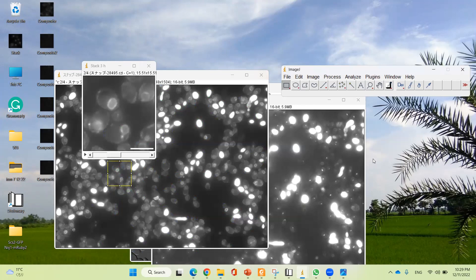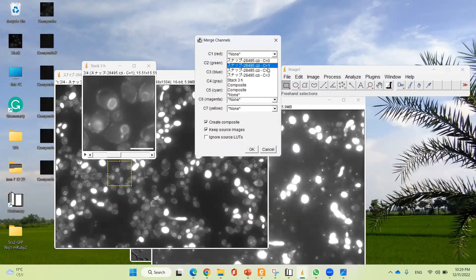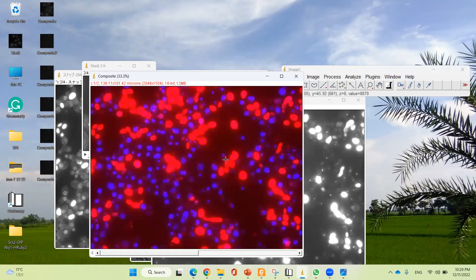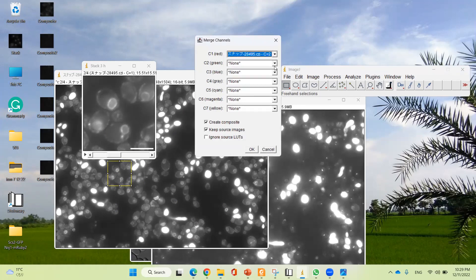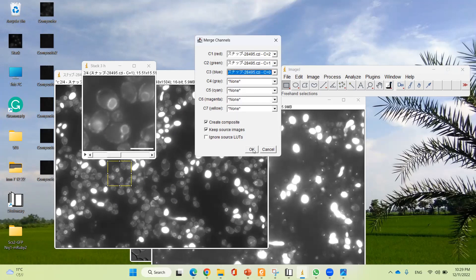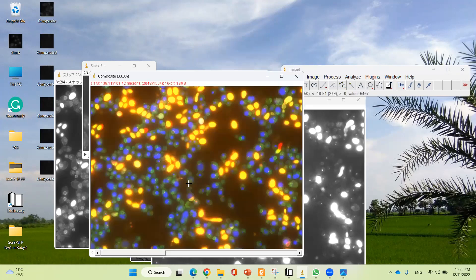Now I'm going to merge blue and red. Blue is C0 and red is C2. Go to Merge Channels — red is 2 and blue is 0. Click OK. This is the merged color of blue and red. Finally, I'm going to merge all 3 colors — red is C2, green is C1, blue is C0. Click OK. This is the 3-color merged image.